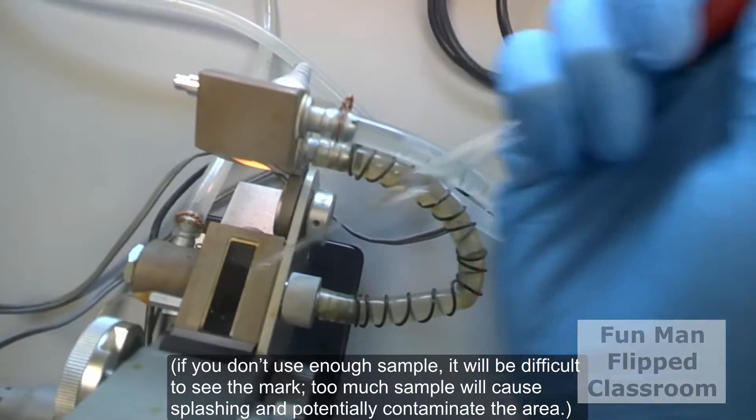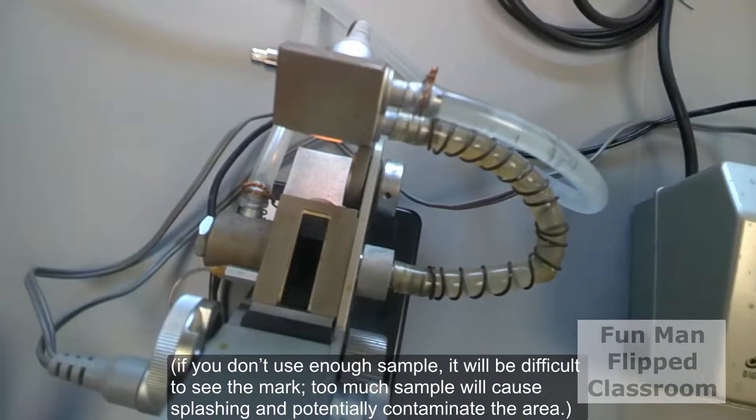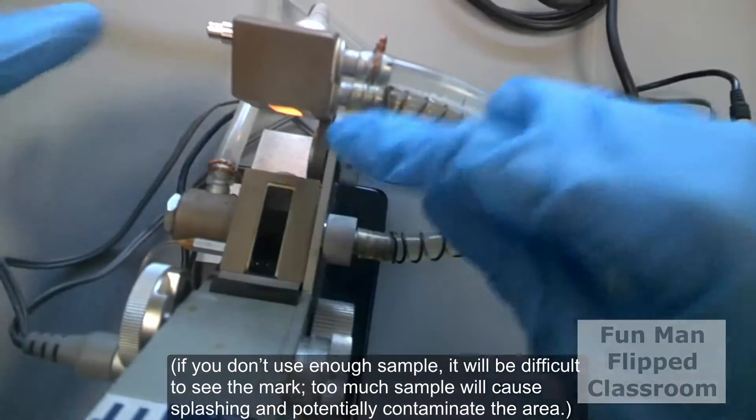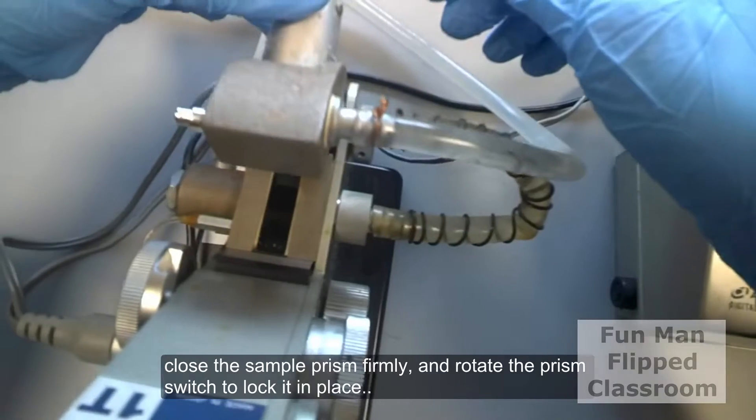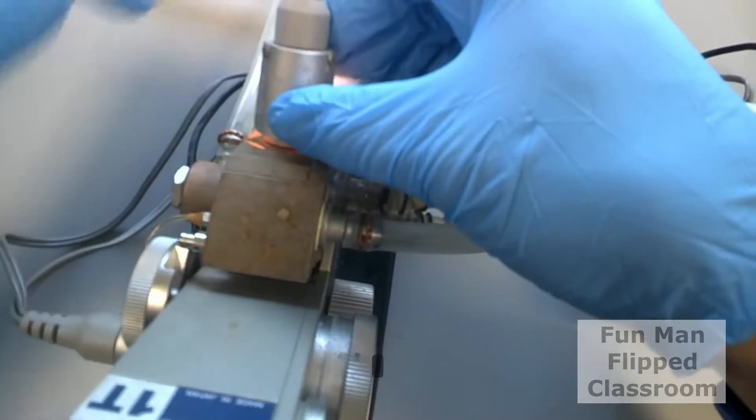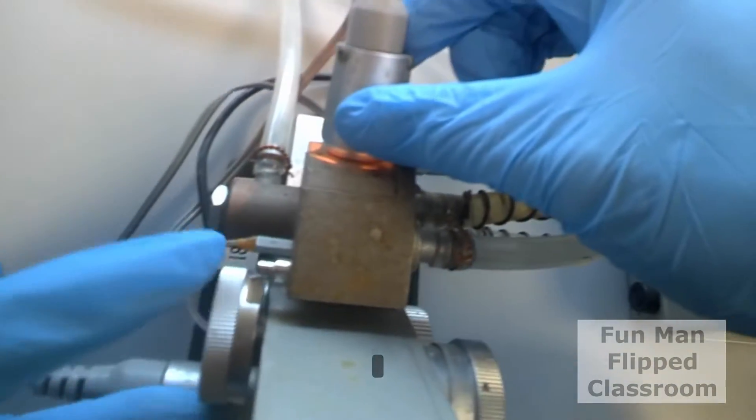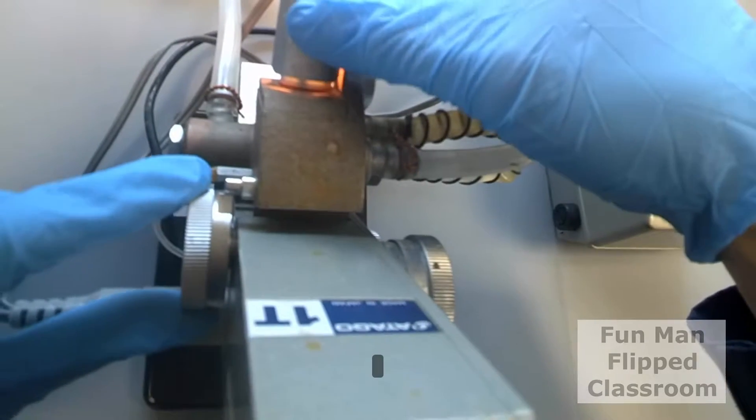If you don't use enough sample, it will be difficult to see the mark. Too much sample will cause splashing and potentially contaminate the area. Close the sample prism firmly. And rotate the prism switch to lock it in place.